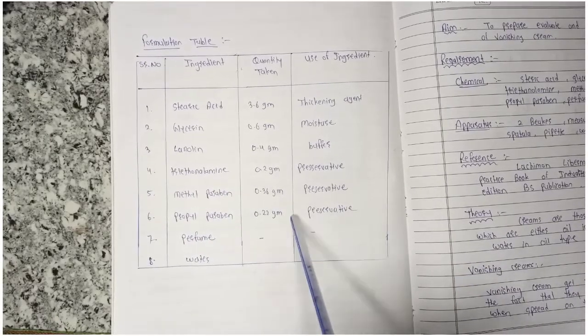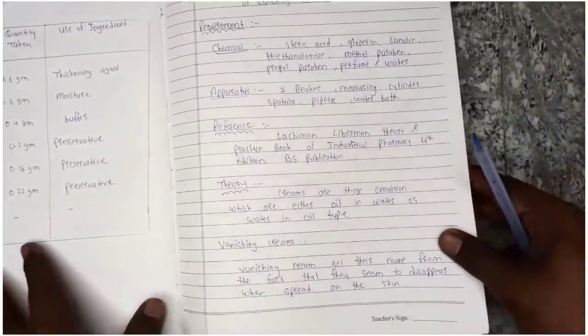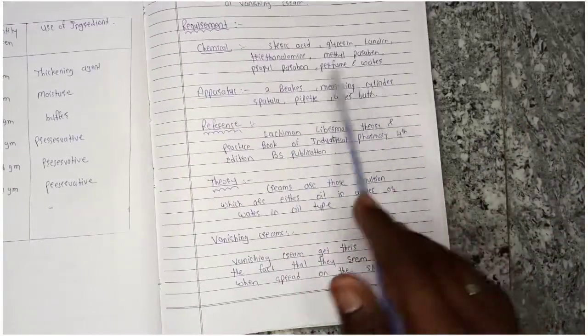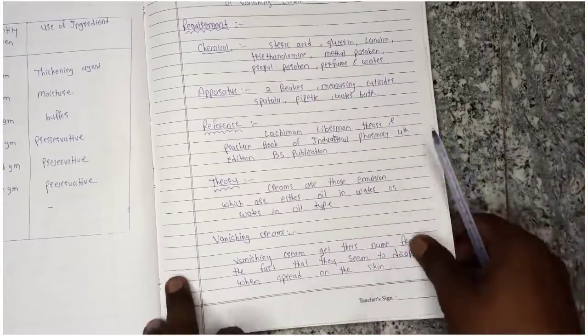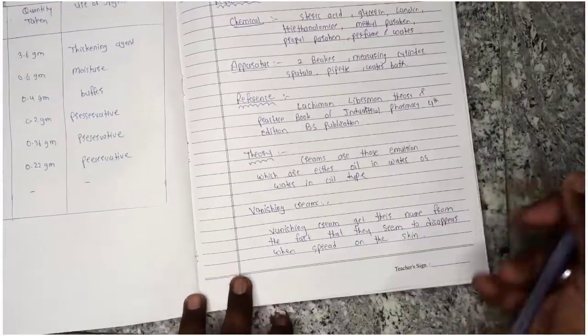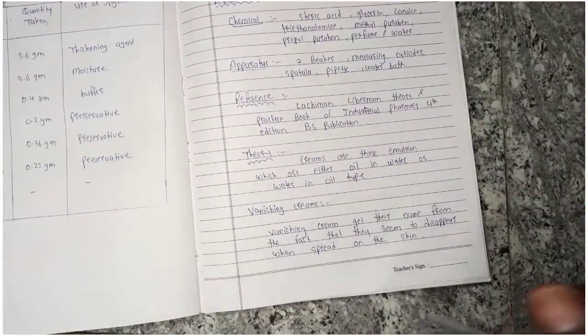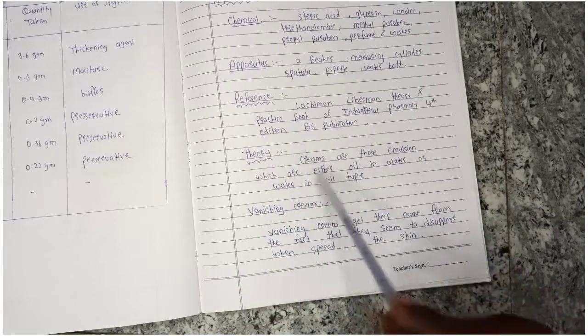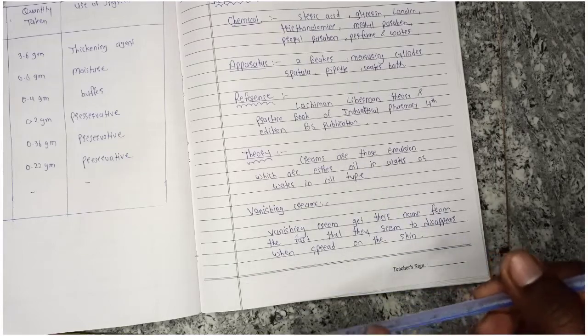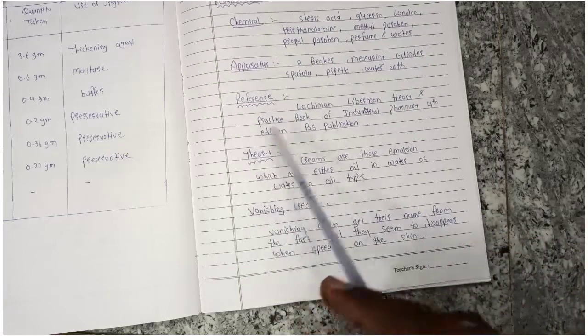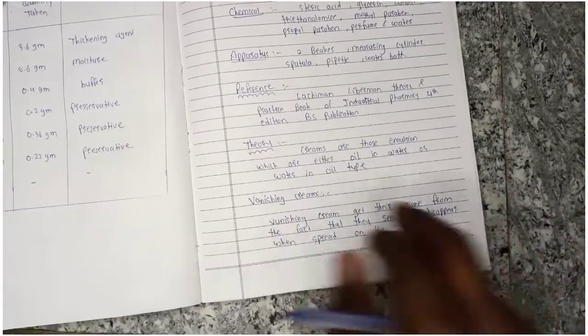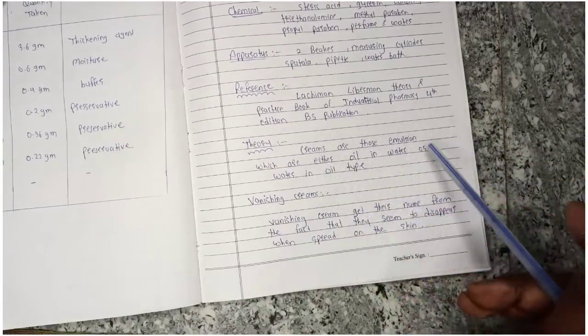We will see which apparatus is needed. We will have two beakers, a measuring cylinder, a spatula, pipette, and a water bath. After that, we will see that creams are emulsions which are either oil in water or water in oil. This vanishing cream is an oil in water type emulsion.